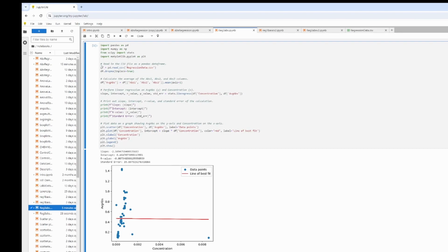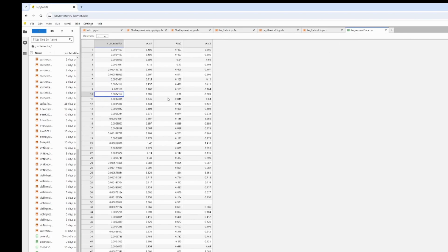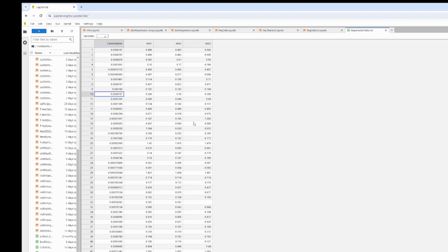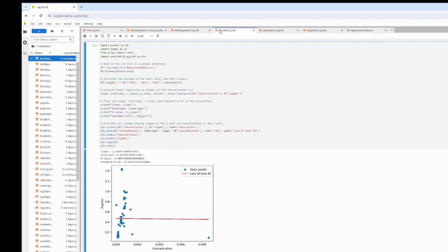So the first thing we do, read in the data file. So it's going to be the regression data, this one right here that we've got. And we're going to drop any null values. The regression analysis doesn't work if there's missing values. And if we go through this, we'll see that we've got one missing right there, and we got an entire row missing right here. So this wouldn't have worked. So we're going through this, and so we're dropping all of those.